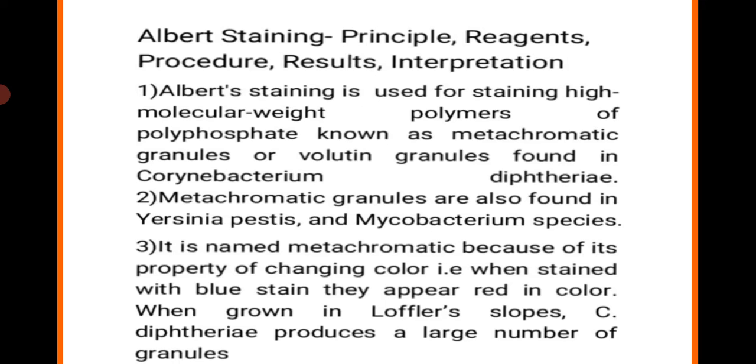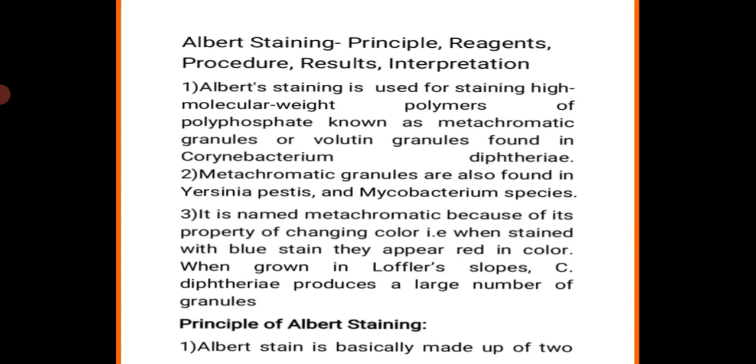A number of organisms show the presence of such granules, for example Lactobacillus, Corynebacterium diphtheriae, Yersinia pestis, and Mycobacterium. When the organism grows on a Loeffler's slant medium, Corynebacterium diphtheriae produces a large amount of granules within its cytoplasm. Then next, the principle of the Albert staining.